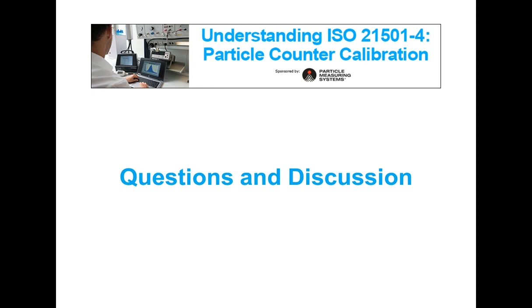Another question, what's the typical lifetime of a particle counter? Interesting question. I would say that we still have 20-year-old particle counters out in the field that are even working properly. So it really depends on a lot of factors.